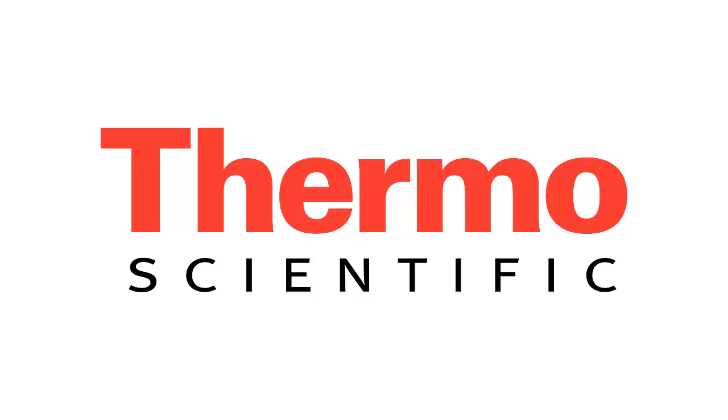In this video, we'll explore basic processing techniques of picoSpin JCAMP data using the Mnova NMR software. We'll describe various processing tasks such as zero filling and apodization and provide guidance on how to set their values. We're going to discuss a lot of detail, so we'll have a firm understanding of how and why we apply certain processing functions. Because of this, we'll break the video into smaller, more manageable segments.